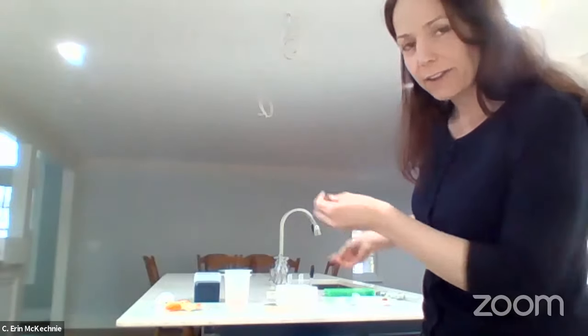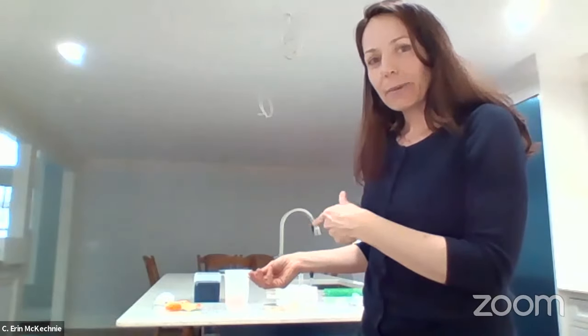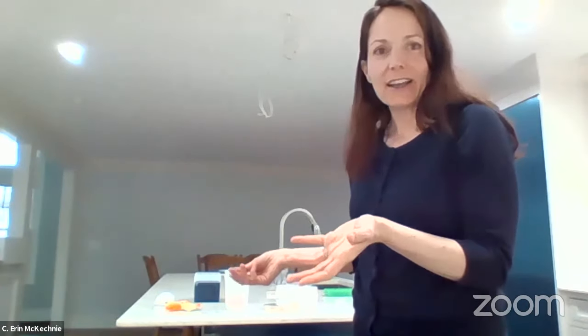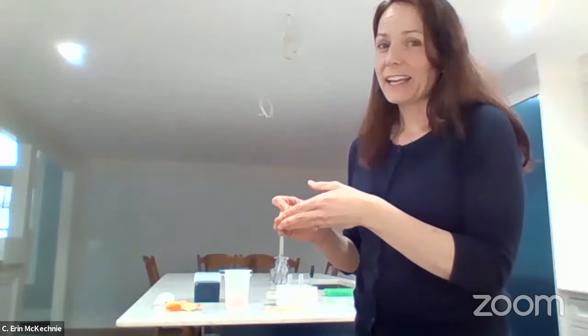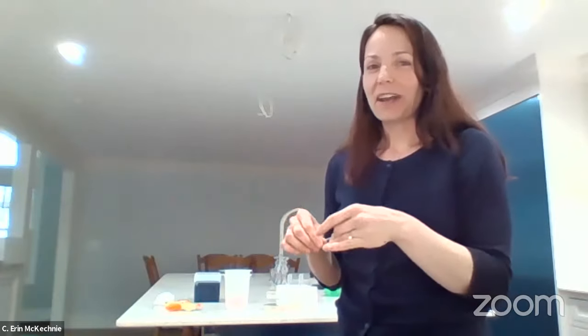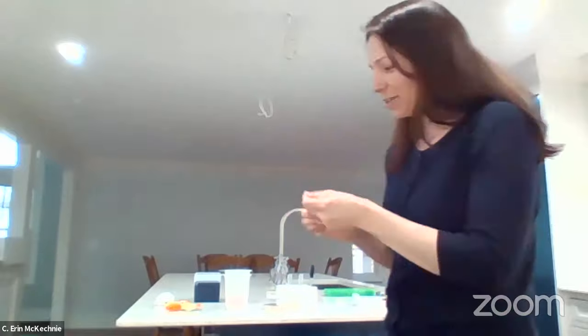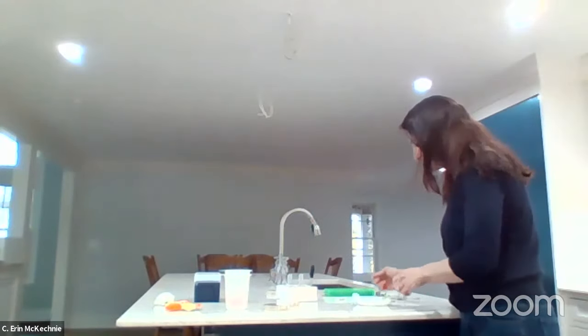There's nothing dangerous about working with these antibiotics. In fact, if I were to pick them up and touch them, nothing would happen to me, but the antibiotic itself is delicate. If I were to touch the antibiotic with my hands, I suspect that the antibiotic would break down. So I don't want to pick it up because I want it to work in the experiment. And for a long time, we couldn't figure out how to pick up these little, we call them pills, without touching them. We tried to use toothpicks in different ways. And then one of my friends came up with this brilliant idea to use a little bit of glue.